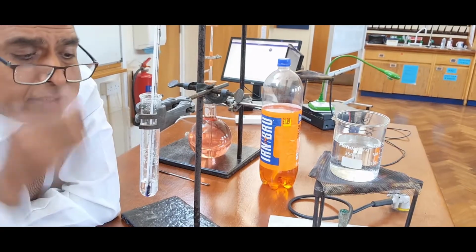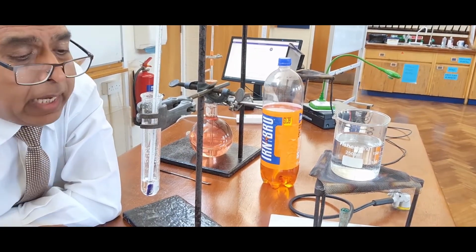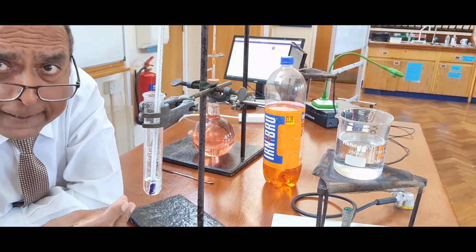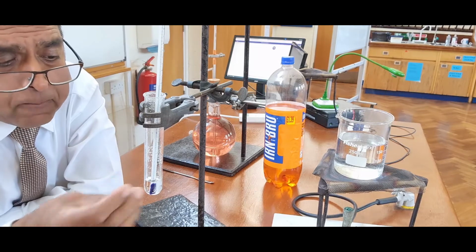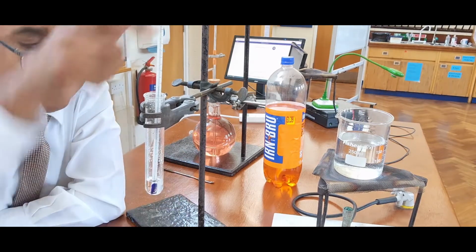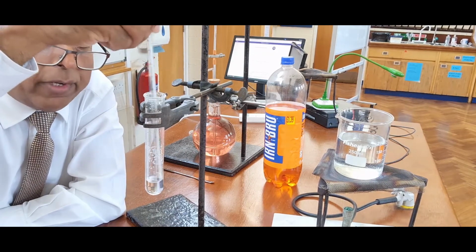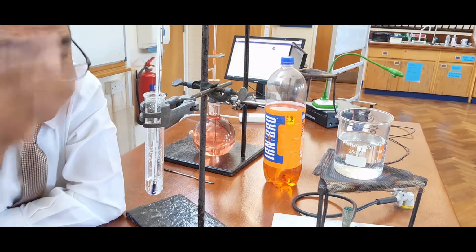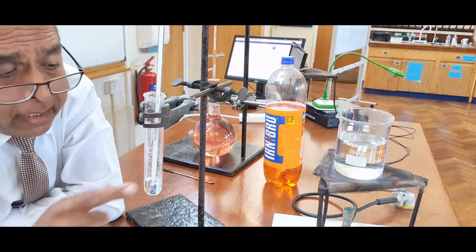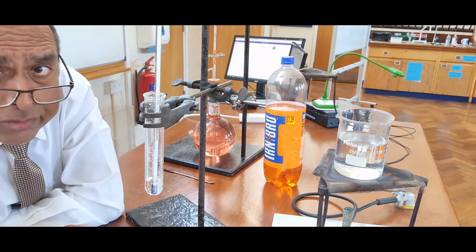I'm waiting for crystallization to happen, and it will give me crystals of ammonium chloride. But the temperature has to get colder and colder until it is low enough for the solubility to be exceeded and for the solution to be saturated. At the moment, the solution is not saturated. That's why we're not seeing any crystals.